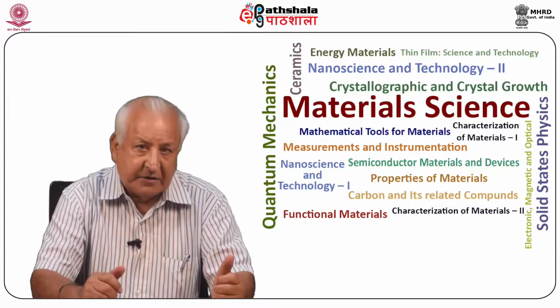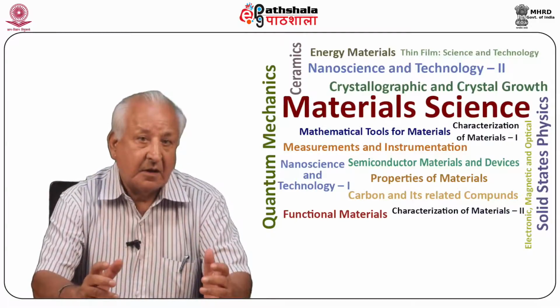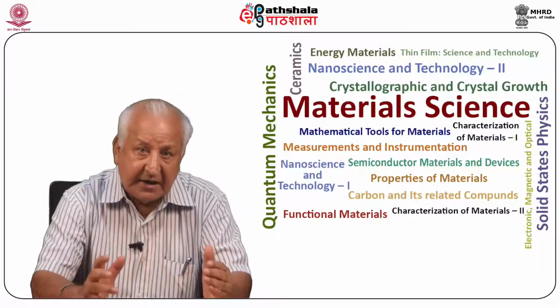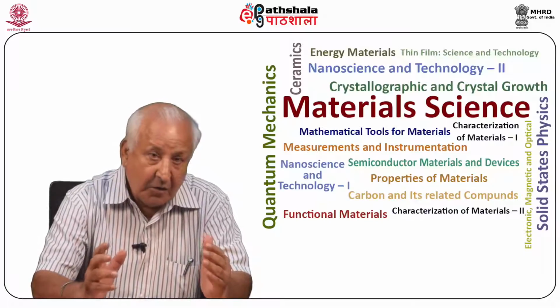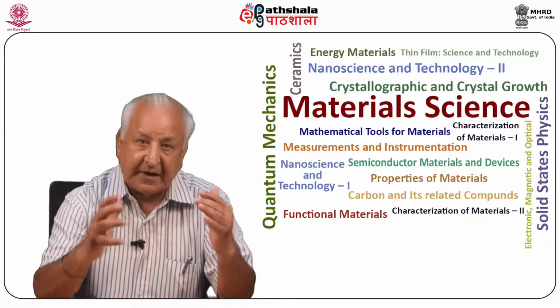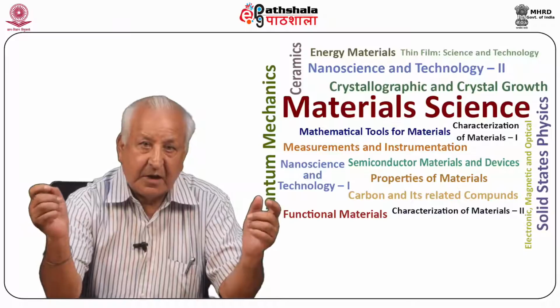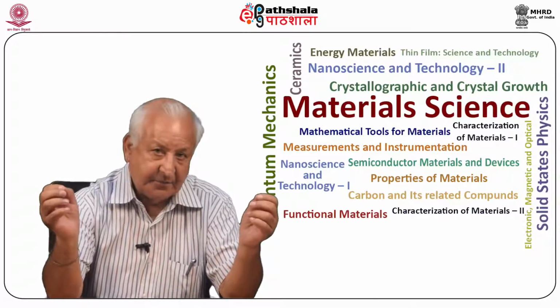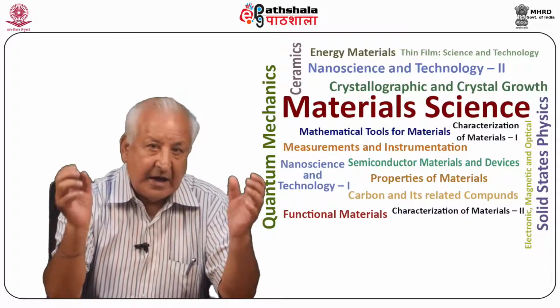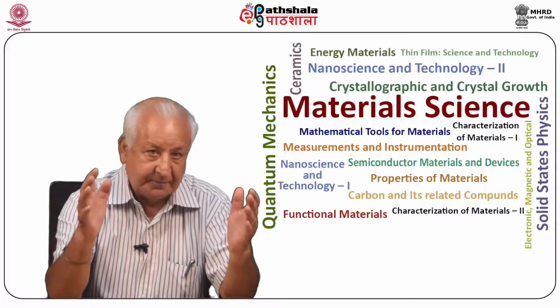The experimental techniques of X-ray diffraction for assessment of crystal defects can be explained as follows. As explained above, X-ray diffraction has the potential of being an exploratory technique for the assessment of various types of defects in crystals. Its penetration through matter makes it a bulk method, as it can lead to investigations into the observation and characterization of defects within the body of the crystal.